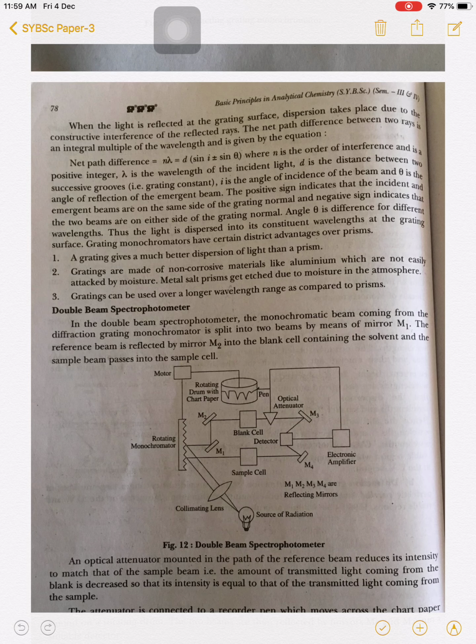Now see here, a grating gives a much better dispersion of light than a prism. Gratings are made of non-corrosive materials like aluminium, and gratings can be used over a longer wavelength range as compared to a prism. So because of these advantages, most of the time for the spectrophotometer we use a diffraction grating as a monochromator.